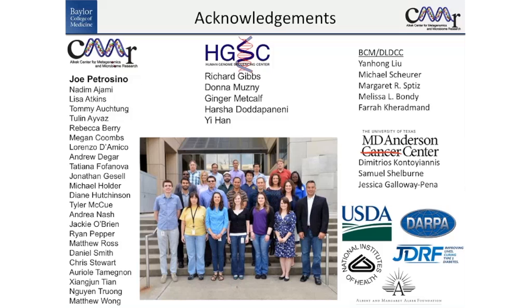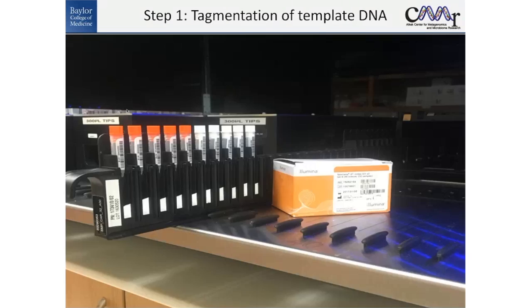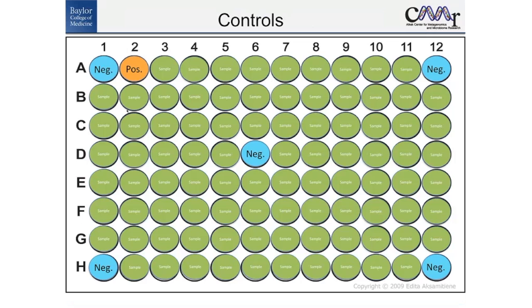We do. So on that plate, let's see if I can back up. Where is it? Yeah. So we add negative controls throughout the plate to look for potential crossover in those samples. And then again, one positive control that's juxtaposed to a negative, because the idea there is that's going to be the greatest signal contribution for the positive control. So if there were to be carryover, we should see it there. And also, we don't see tularensis in our samples, so if it shows up, we know we have an issue.